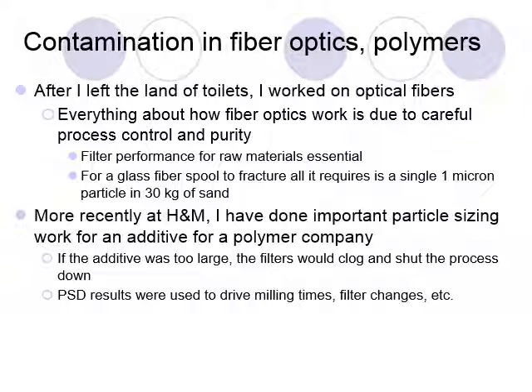While working at H&M, like Dr. Miller does, I've done a lot of the particle size work. I've done work for an additive company where they would be putting certain interesting materials into their polymers to provide certain properties that they wanted, and based on particle size they could determine how long they had to mill the product to get the color behavior and other behaviors they needed without causing the filters to clog and shut down their whole process. So particle size is important once again.